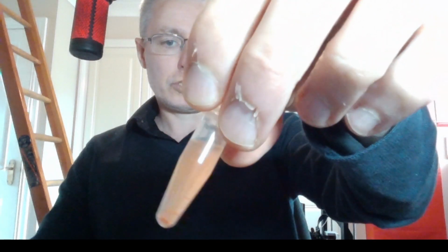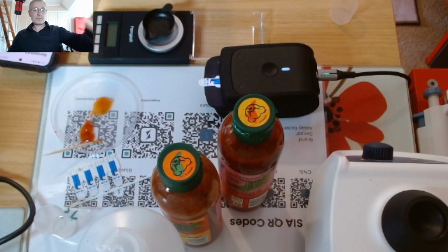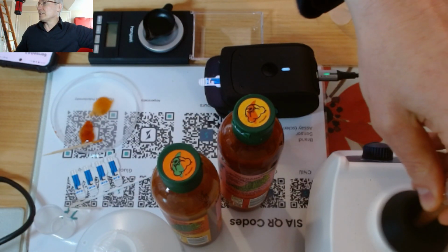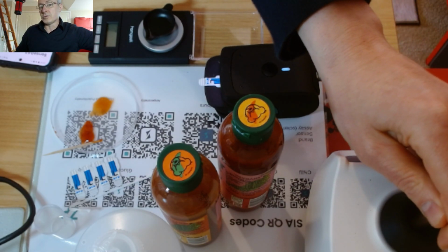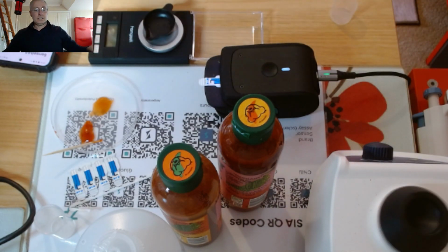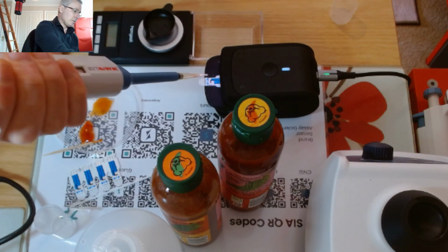There are some chunks and bits at the bottom of this, so I'm going to give it a quick vortex. I've got a vortexer here. When you say the word vortex, it sounds like an expensive piece of equipment, but these are really not that expensive. You can get them off Amazon. It's just a standard little lab vortexer. And I will take my sample and put it onto the sensor now. Right, so here goes.